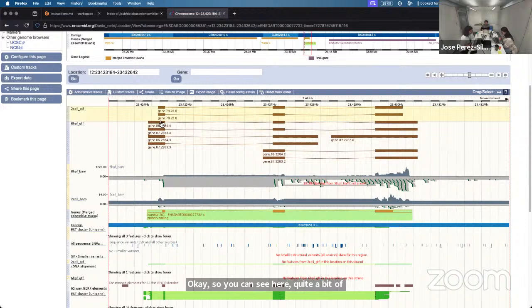For instance, this first exon seems to be much smaller in the 2 cells than the other one. This exon seems to be also much longer in these isoforms. Here, Scallop has found what could possibly be a monoexonic model, which will likely not be a true one, but we'll get into that later.